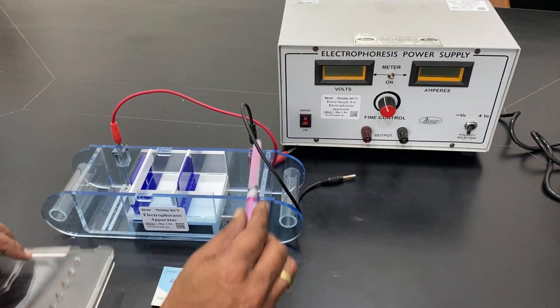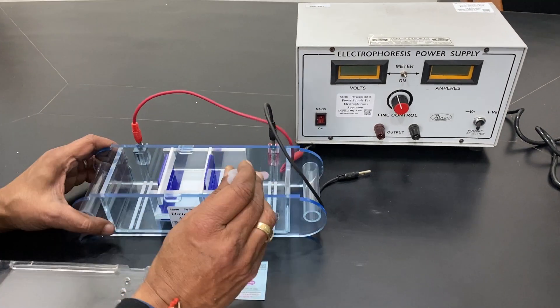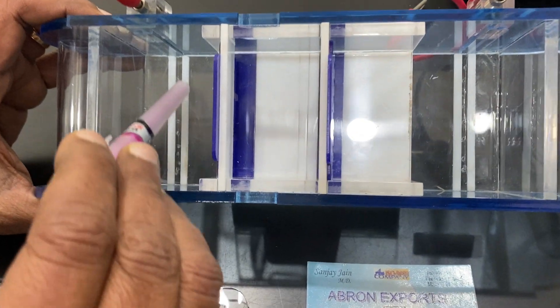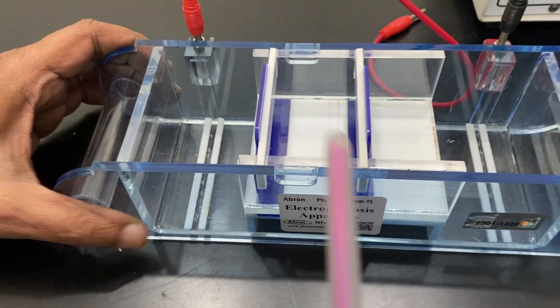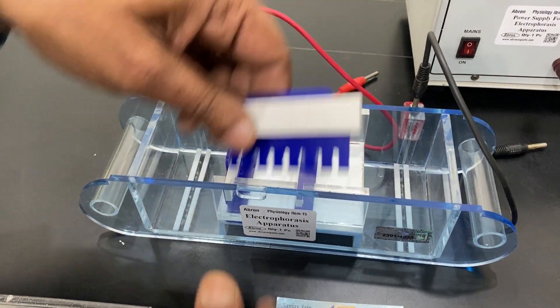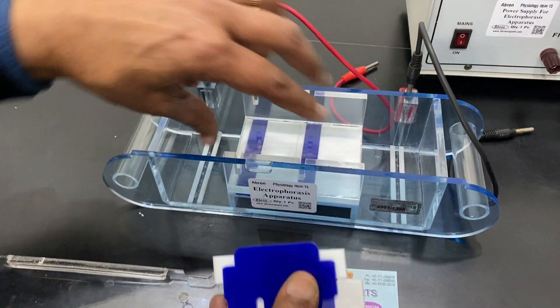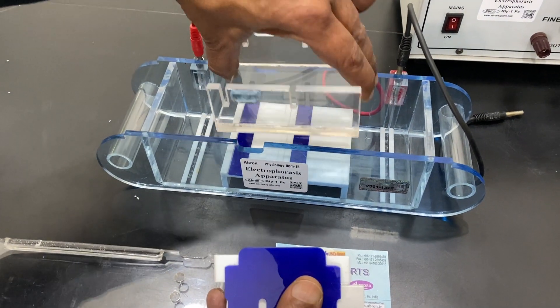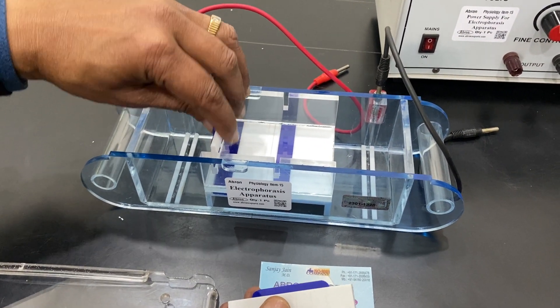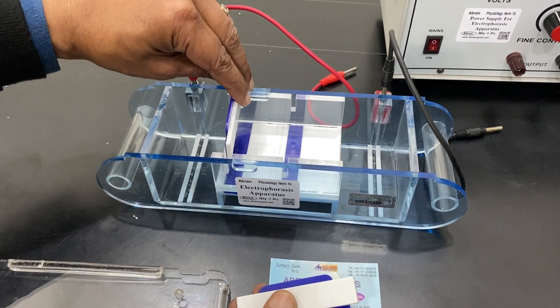On the back side there are two connection points, and inside there is a platinum wire for connection. There is also a platinum wire for connection on the other side. Here we have two chambers — you can take out the forms, make a gel, and perform gel electrophoresis. We have different models available.